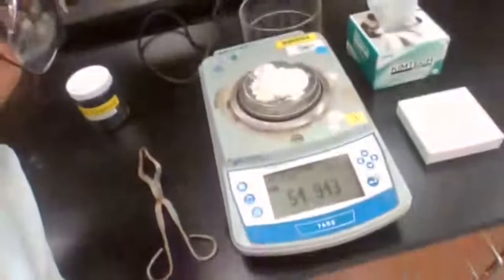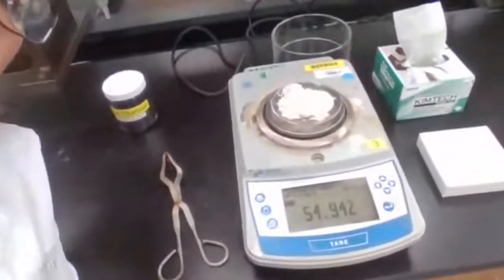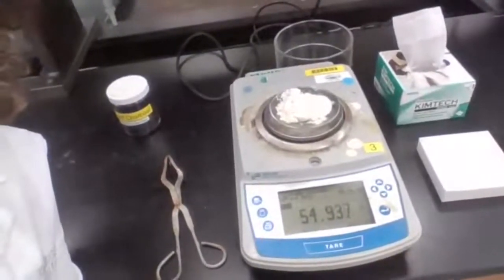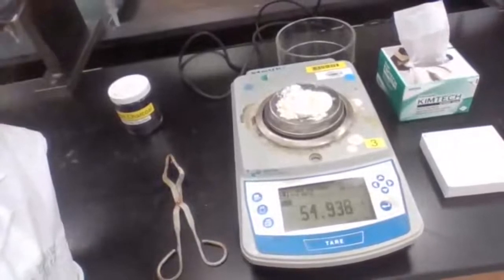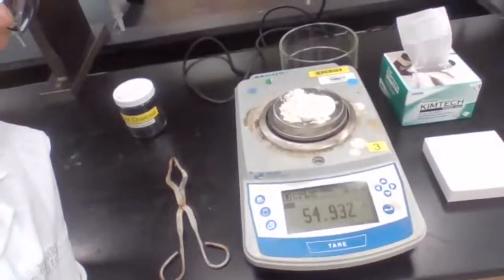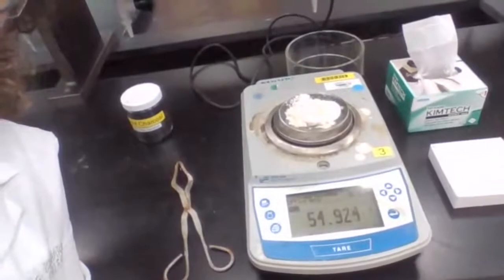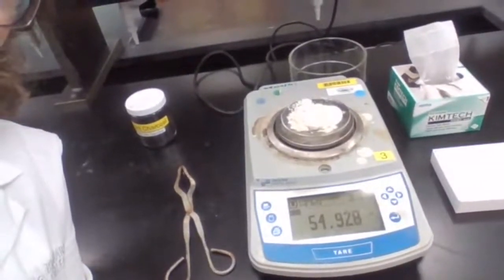Okay, let's see. I wasn't looking. Okay, does it show now? Okay, perfect. Please take a screenshot, and that would be your number for the mass of product, filter paper, and watch glass. You subtract the number you got earlier to get the mass for the final product only.